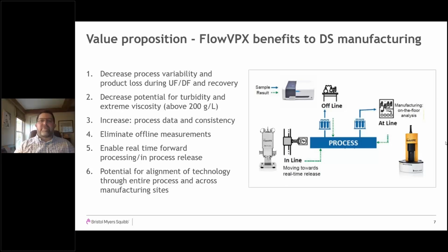they measure concentration during UFDF, the way they know when to stop at a UF2 point is based on mass. Because they take a concentration at the beginning, based on the change in mass they can extrapolate what the concentration should be, but they do not know the exact concentration. Because you have a bag and there's a holdup volume, the holdup volume is not being weighed.